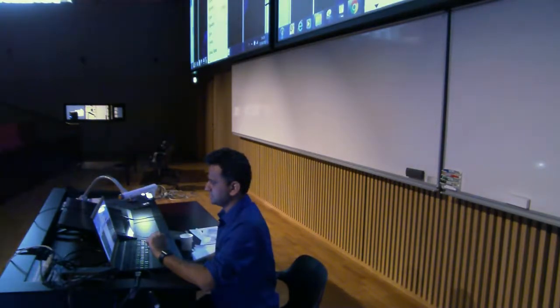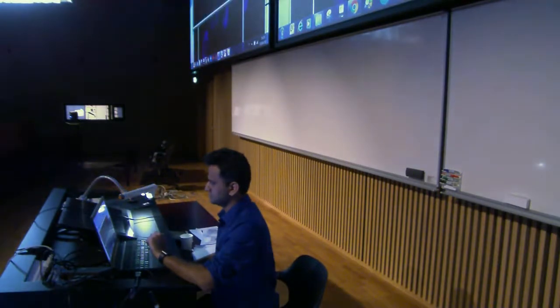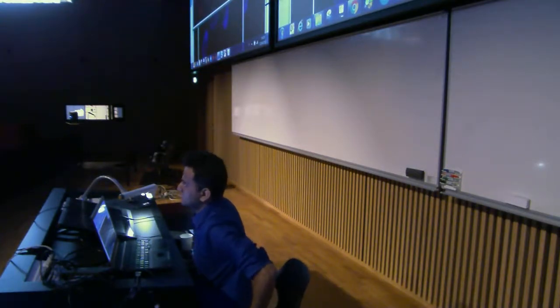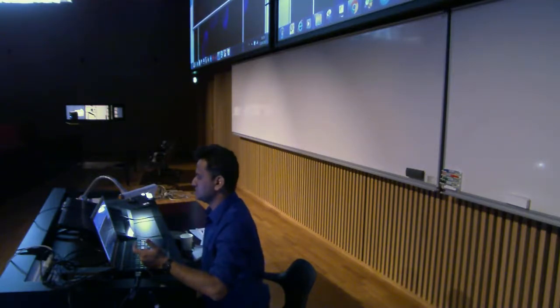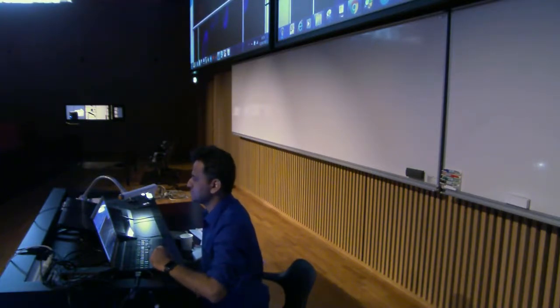And then I go to image again, stack, make montage, perfect. Okay, so you have to switch off the overlay because overlay is not a part of the image. So whenever you switch on the overlay, overlay will be a part of the metadata, even if you save that image as an RGB. Okay, the reason we put it here is because it was in selection mode. But this is how you do that. Okay, the scale bar.